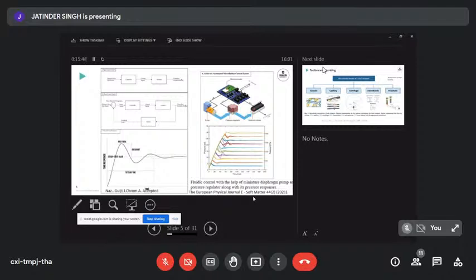You switch your pump on, your pump is all excited and it overshoots. The little bit of overshoot, so the difference between your steady state line and the height of the first peak when the pump fires, oh, sorry, I went too much, that's called the overshoot. Then the pump is regulating back, so you go a little bit under. And then you've got a smaller overshoot and you go again and then you stabilize.